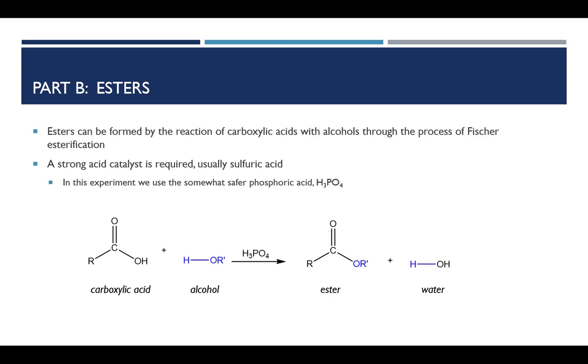So this is the generic reaction that we would be using to combine carboxylic acids and alcohols. Notice how I've chosen to write the carboxylic acid with the OH group pointed off to the right. I've chosen to draw the alcohol with the oxygen bonded explicitly to its alkyl group and the hydrogen sticking out. The reason I choose to do it that way is because I find it easier for students to figure out what the product is going to be if you always write esterifications this way.